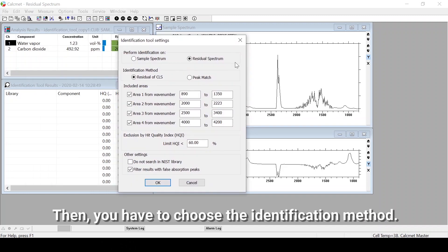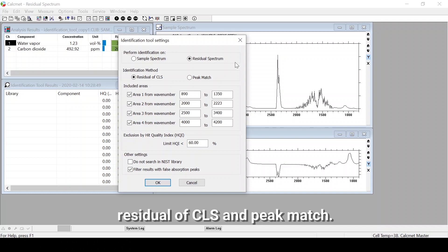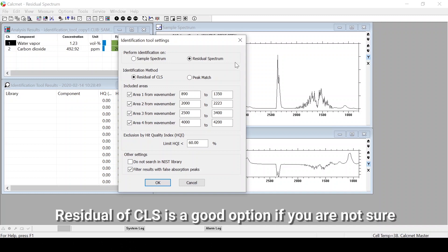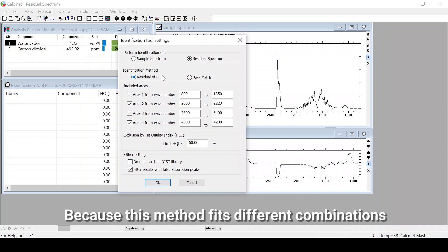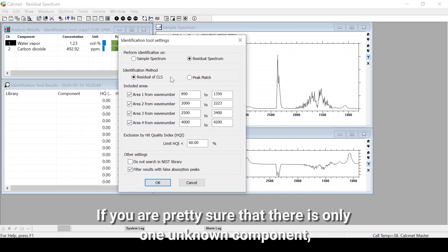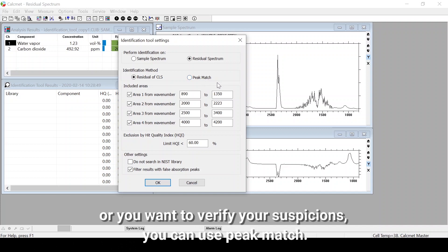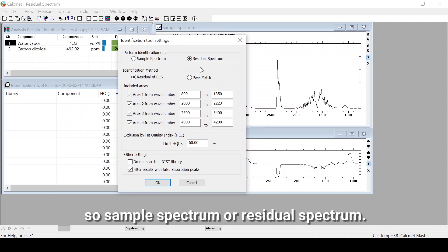Then you have to choose the identification method. There are two different methods: Residual of CLS and Peak Match. Residual of CLS is a good option if you are not sure whether you have multiple unknowns or just one, because this method fits different combinations of reference spectra to the sample or residual spectrum. If you are pretty sure there is only one unknown component, or want to verify your suspicions, you can use Peak Match, which compares individual reference spectra to the selected spectrum.